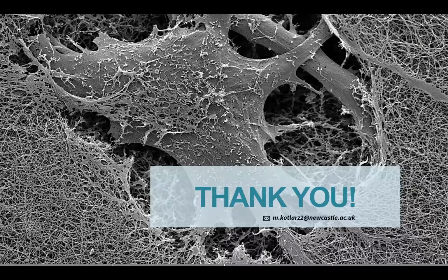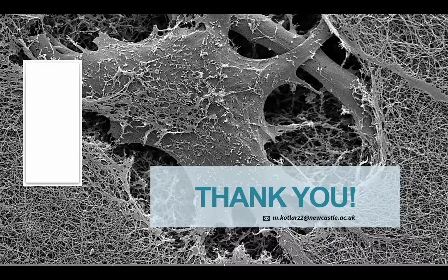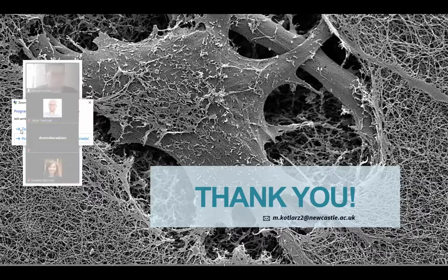Great talk, thank you very much. I actually do something a bit similar because I work on similar gels, but actually the cells produce it themselves. So just a quick question: maybe I missed it, your biopaper, how you call it, is it just artificial polymers, just functionalized with some small peptides, like sort of recalling the ligands for some cell receptors, or is it actually ECM proteins like collagens, fibronectins, or natural products which would usually be also, for example, in the skin?